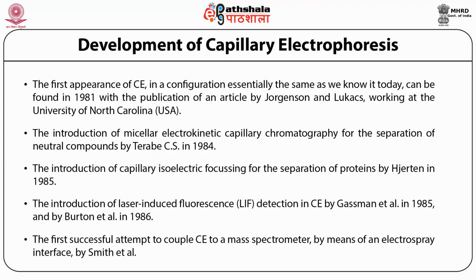The development of capillary electrophoresis. Electrophoresis has been defined as the differential movement of charged species, ions, by attraction or repulsion in an electric field. Electrophoresis as a separation technique was introduced by Tiselius in 1937. Placing protein mixtures between buffer solutions in a tube and applying an electric field, he found that sample components migrate in a direction and at a rate determined by their charge and mobility. For his work in separation science, Tiselius was awarded the Nobel Prize.